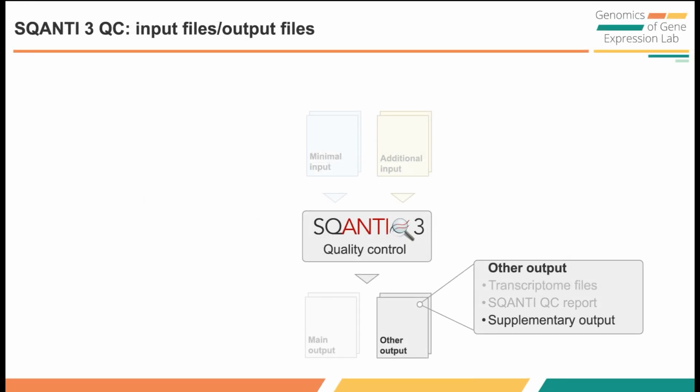SQANTI QC also generates some supplementary output files. Find the details of those files from the following URL.